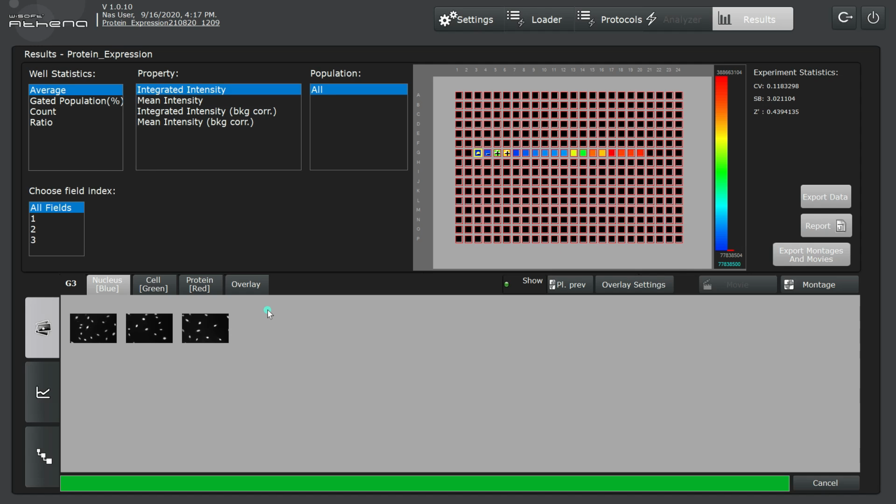Within the Image Explorer menu, we are given a series of tabs along the top, each corresponding to one of the color channels that has been acquired in the dataset. The heatmap present at the top of the screen now serves as a navigation tool to select the well where we would like to visualize images. Below it, we see a button that allows us to turn on and off the visualization of masks that were determined during image analysis. Obviously, this button is inactive when a dataset has not yet been analyzed.